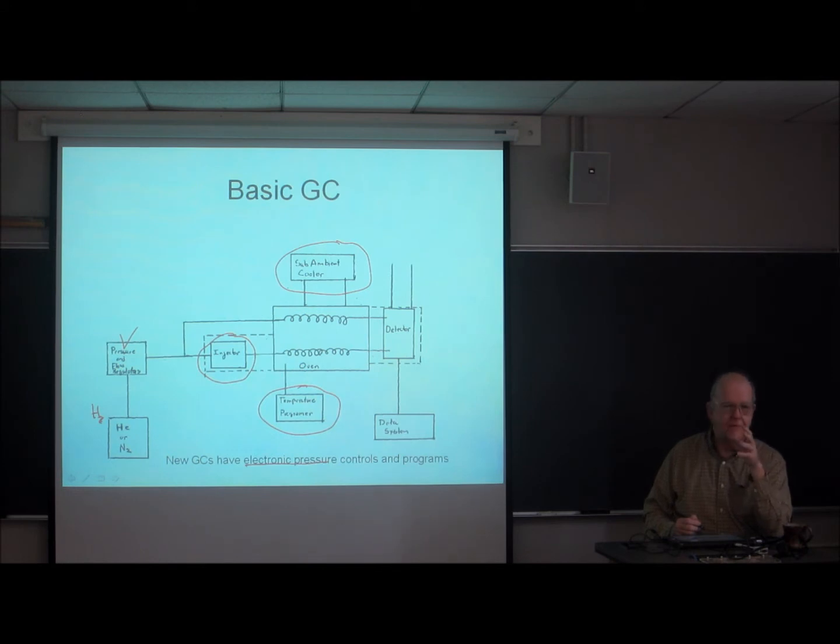Something like carbon tetrachloride, no. Perfluorocarbons, no. But almost anything else will give you a decent signal on a flame ionization detector. And then, of course, that feeds a data system to help you analyze the data.